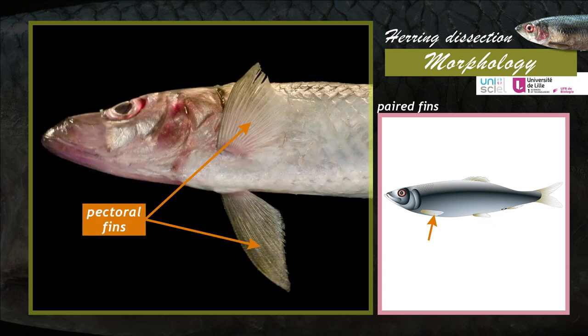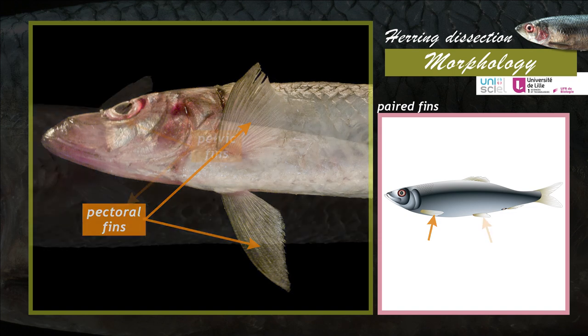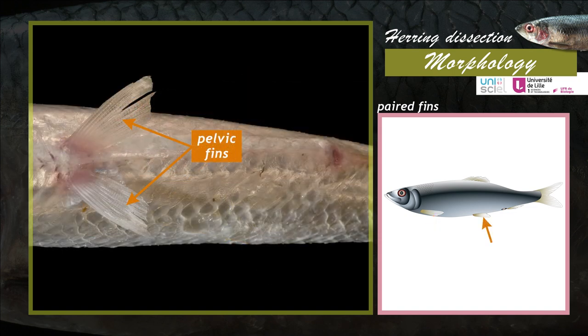The herring has two sets of paired fins. The anterior fins, or pectoral fins, are located behind the operculum. The posterior fins, or pelvic fins, are located on the ventral side, in front of the anal and urogenital papilla.